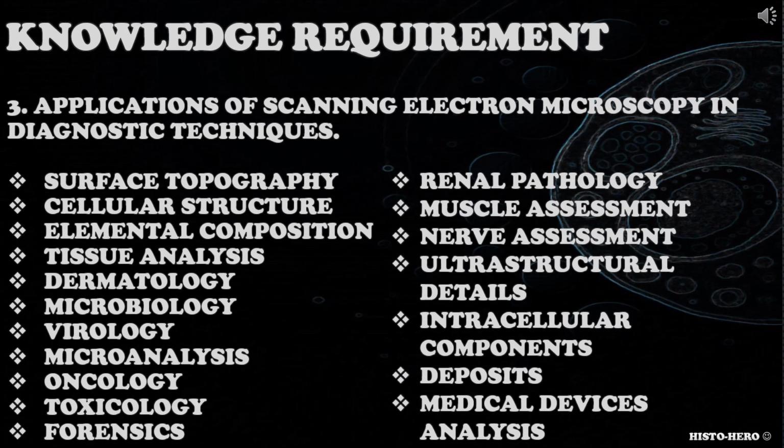The third knowledge requirement is applications of scanning electron microscopy in diagnostic techniques. Candidate needs to have the knowledge and understanding about application of SEM. You could ask the candidate to explain what is SEM and how it works, to name the clinical applications of SEM in diagnostics, to name diseases that can be diagnosed or investigated using SEM.